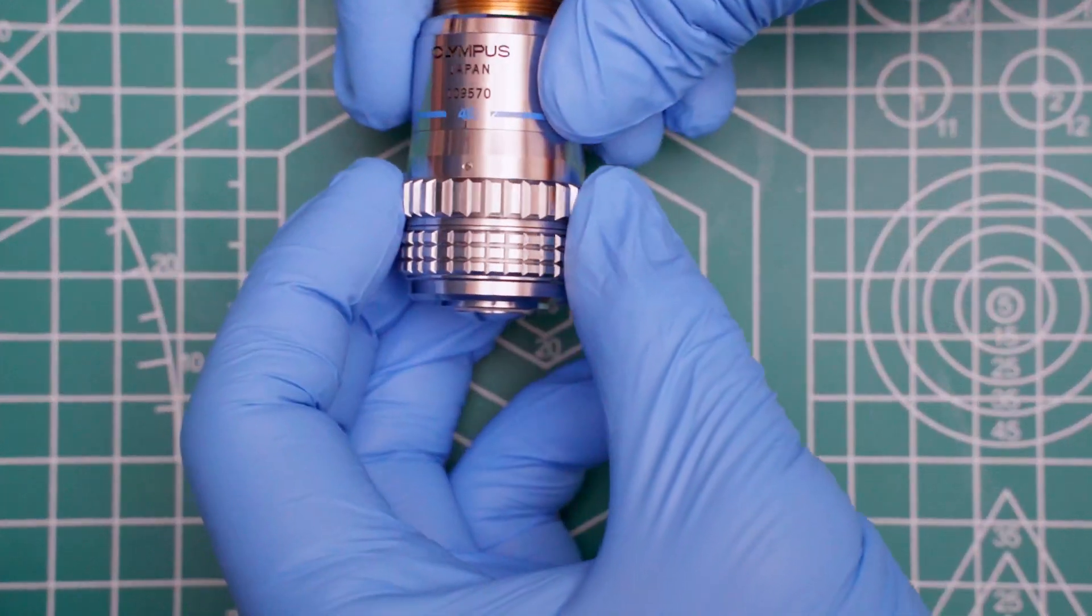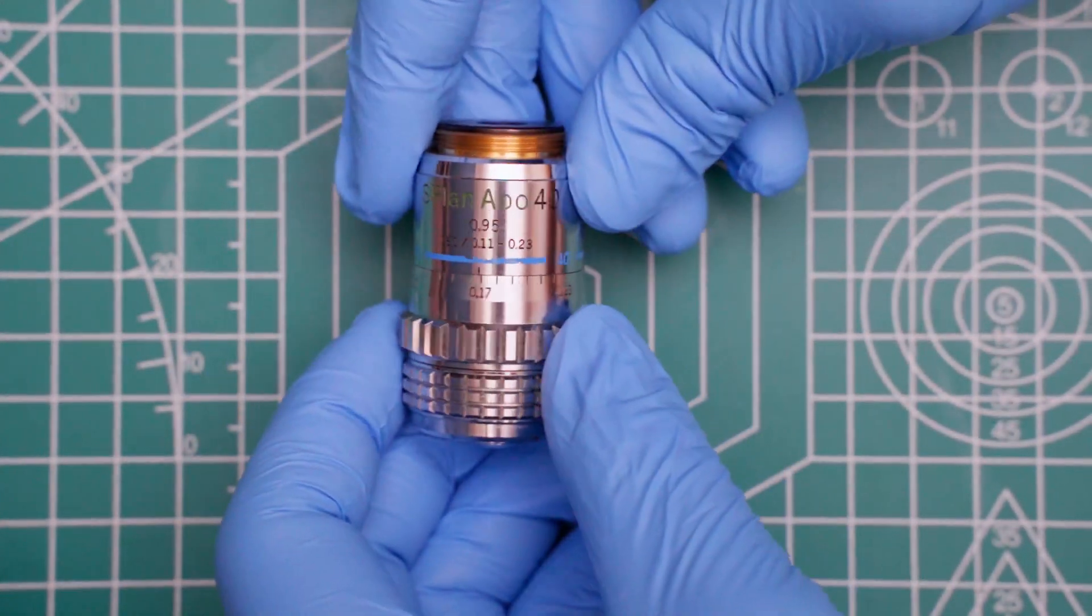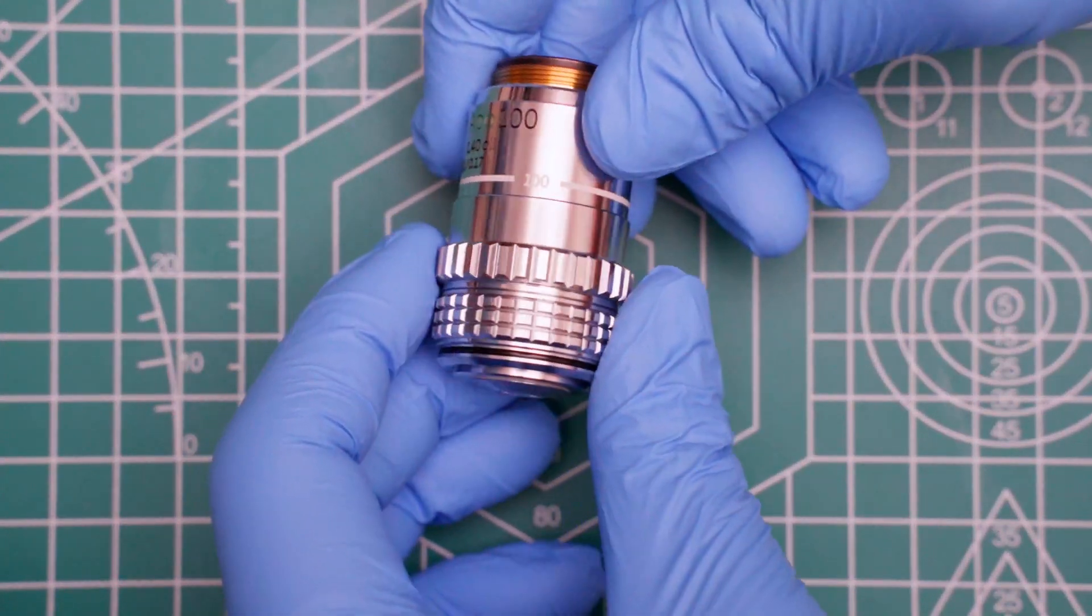Hello, hello from Diatoms Diatoms. I'm Jason, and today I want to help you select some premium quality objectives to upgrade your microscope.